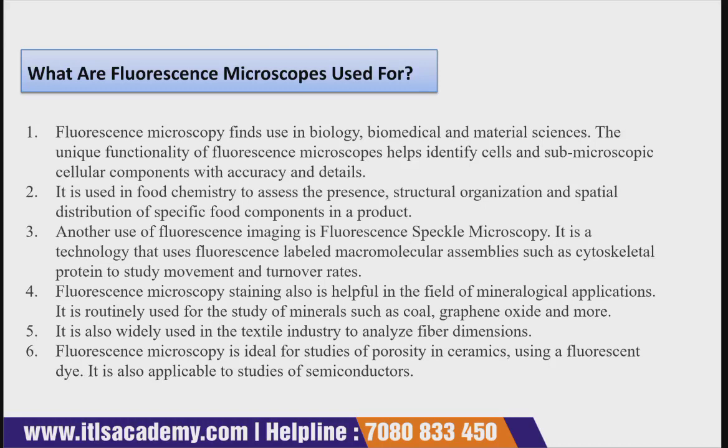Now, what are fluorescence microscopes used for? What are their basic applications and uses? Fluorescence microscopy is used in biology, biomedical, and material sciences.